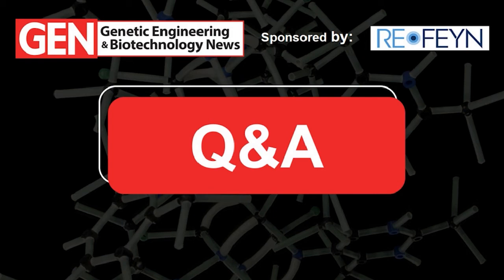Yeah, so that's an interesting question. We are pretty confident at this point that we can do that. And you may have seen in some of the graphs, the histograms that we've shown, that there's a full and an empty peak, and then there's something in between. So it doesn't go all the way to zero. There are particles detected, and these particles are partially filled AAVs. We're currently still investigating together with partners to validate that we can reliably quantify the partially filled capsid ratio, but we are very confident that we will soon be able to launch that as a feature.